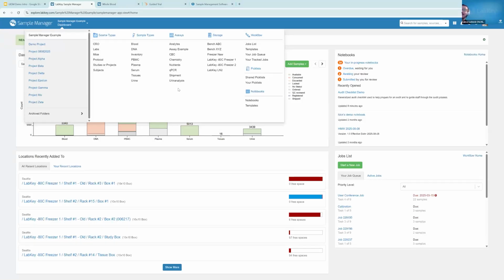We currently support biobanks that have that information. If you want PHI, you would need the compliant cloud because that is a little bit different than a standard cloud. You might know like your Google Suite's not necessarily HIPAA compliant unless you have the HIPAA compliance there. So there's always something to keep in mind, but you can definitely have donor medical information with that.